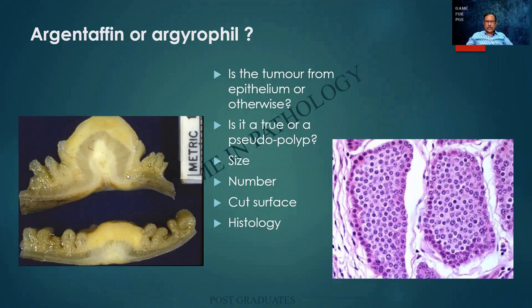Look at this lesion over here. It is projecting, and this is the mucosa. There is a partial ulceration of the mucosa, but the lesion is not arising from the mucosa. A second clue is it has got a yellowish tinge. This is a classical picture of a carcinoid tumor. It can present because of various manifestations. It can have the carcinoid syndrome, or because of an intussusception or partial obstruction. So these things you people will have to know.